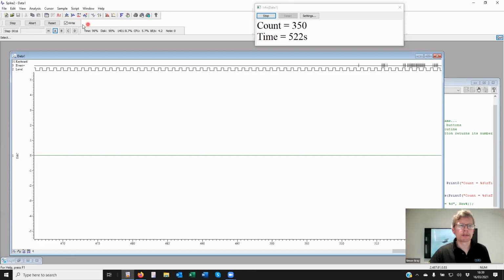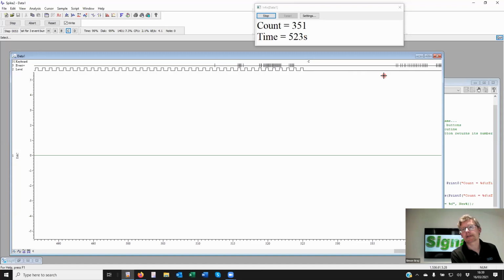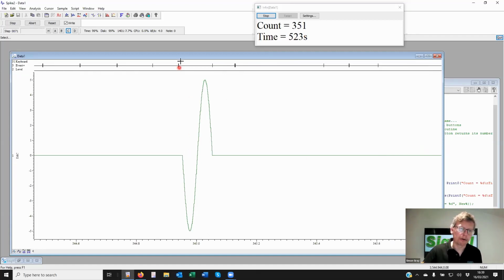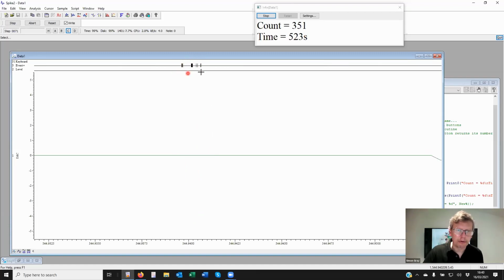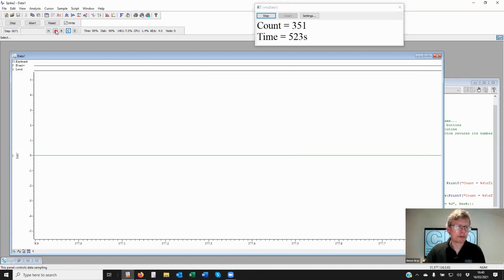Okay, nothing happens until I press C. That section has caused the stoppage of all of the digital outputs because I haven't set those to continue in any way or be reproduced in that section. Digital markers come through. That is not considered a burst until we start getting faster. And then when we've matched the event burst parameters at this point here, there are actually more markers and more events in there than it might first appear, then the sinusoid was sent out. So that is an event burst. And obviously, a very short period of time, that's less than 0.1 seconds. Okay, so that was an event burst. Before we let this continue on, let's have a look at some of the others there. I'm going to slow down time here.